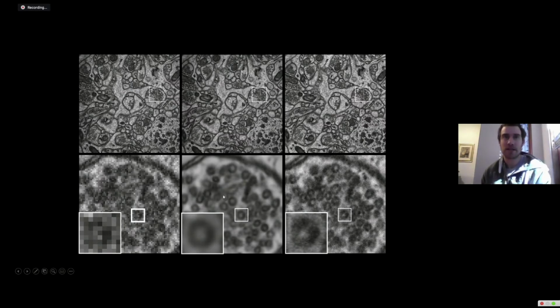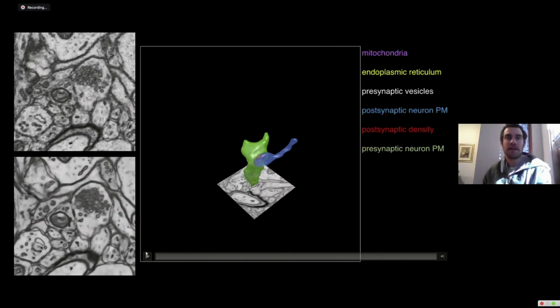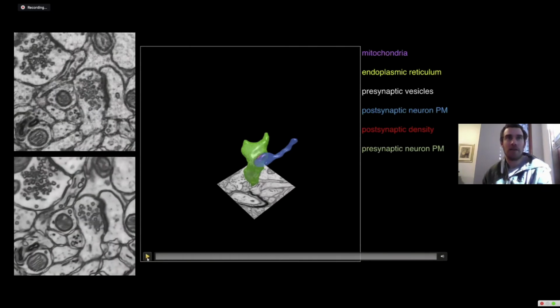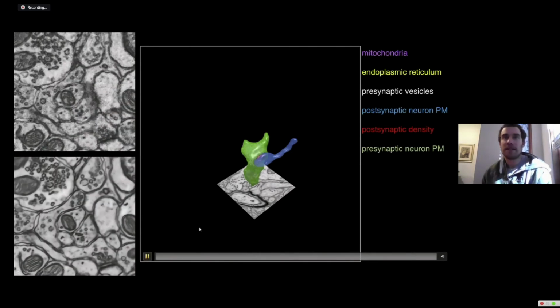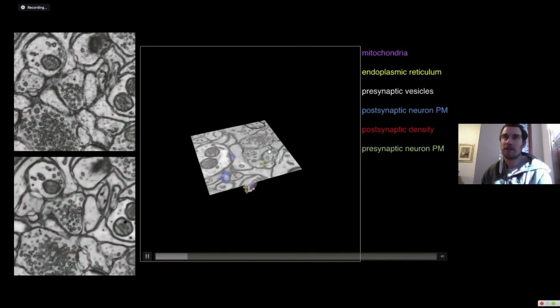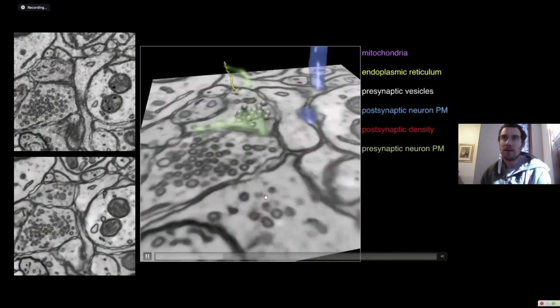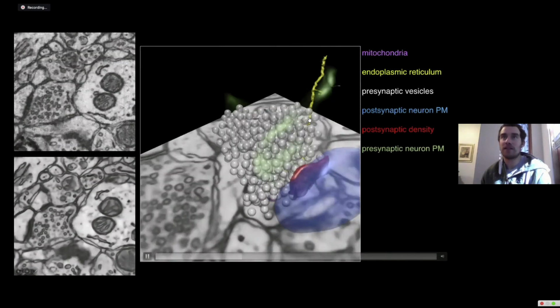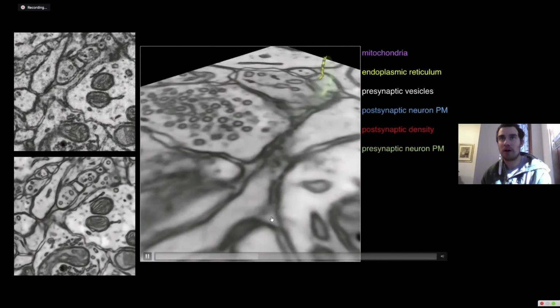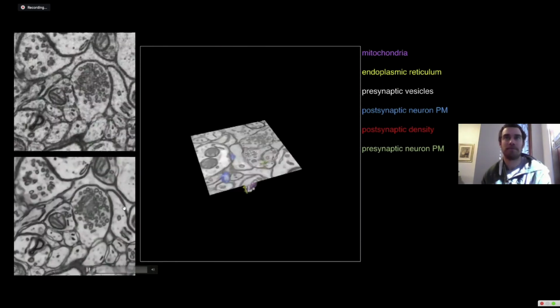And that's exactly what Linjing did here. That enables us to do very effective segmentation, where we can look at the relationship not just between one cell and another cell, but inside of one cell, looking at different components of the cell, like vesicles and endoplasmic reticulum and mitochondria, and seeing how those relationships change under different conditions as well.